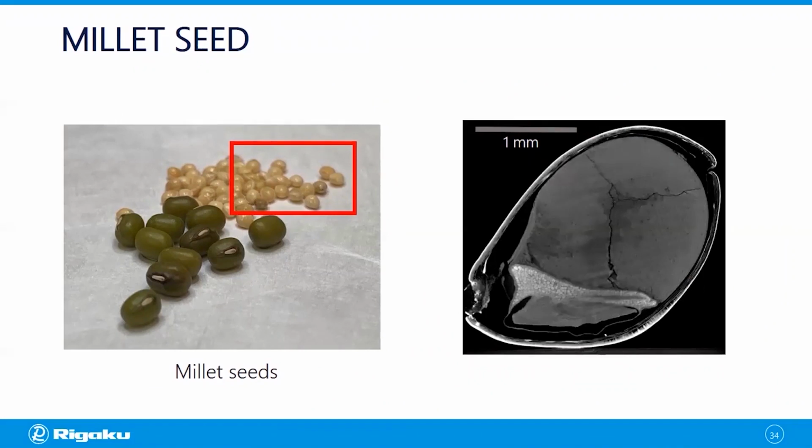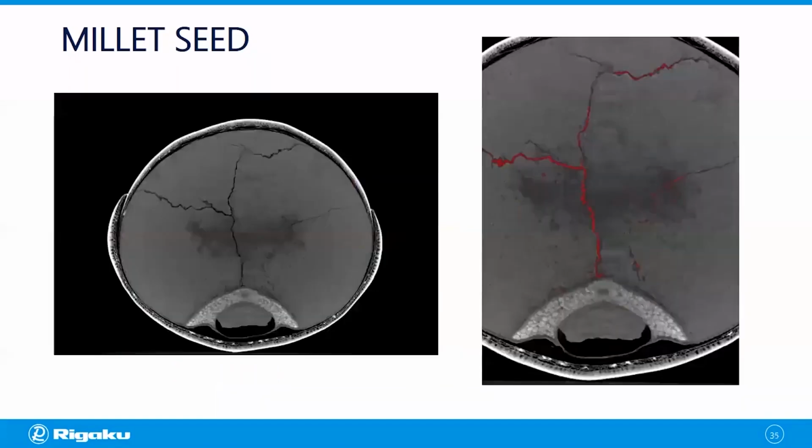And for those of you unfamiliar with millet, these are small-grained, warm weather seeds belonging to the grass family. They're annuals, and they are highly drought tolerant, and they have a nutrient content that's similar to cereals. So as you might expect, they're an important crop for investigation, and many groups throughout the world perform research of these important samples.